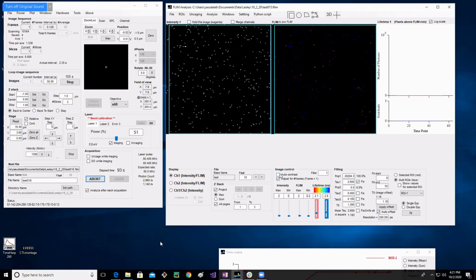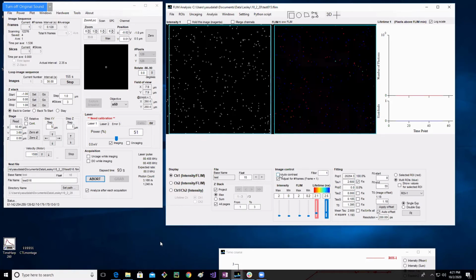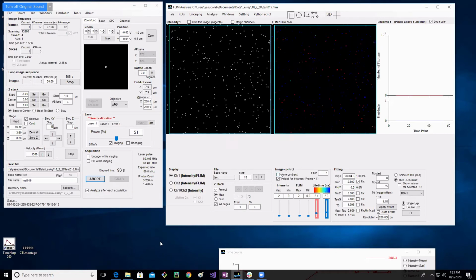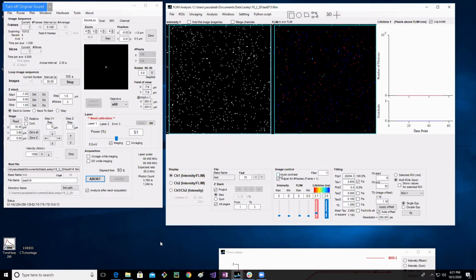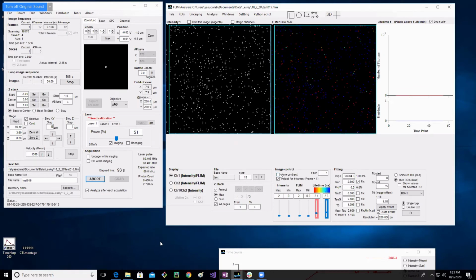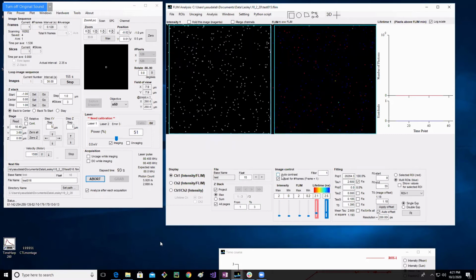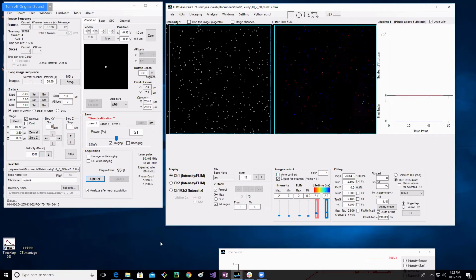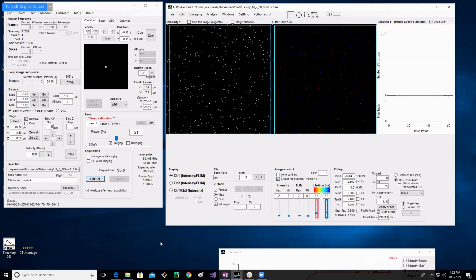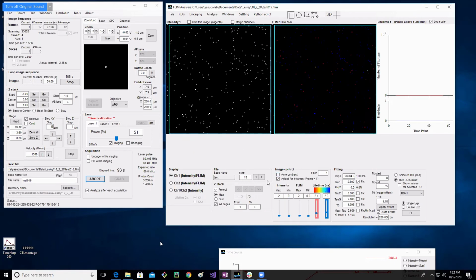Usually you can tell by the noise, watch me not be able to show you, when you're out of the slice. So, okay, this is very subtle to see, and I don't even know how well it's transmitting over the computer. But right now, I'm out of the slice. I'm going to go down slowly, and you should see the noise increase. Okay, so going down.